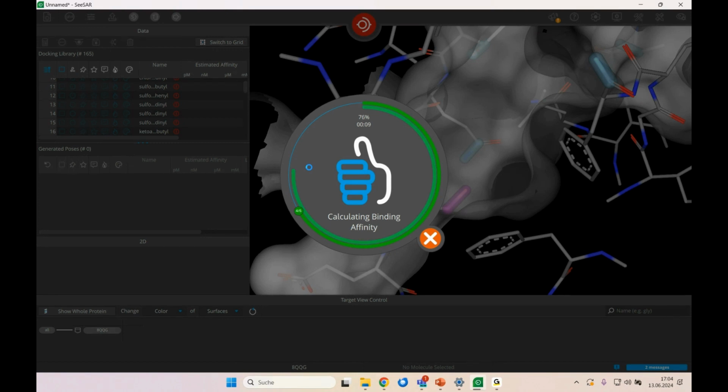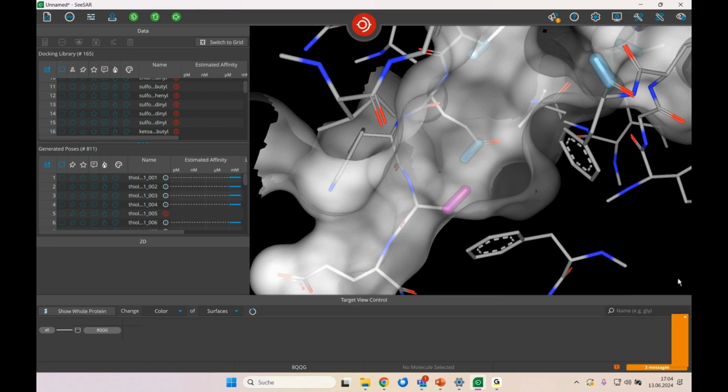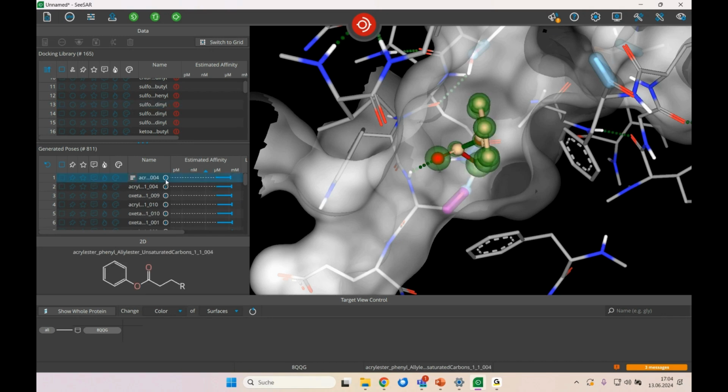So basically, this is also quite novel to the software. It was introduced in 13.1. The warheads that are now present in compounds are automatically detected and transformed into their bound form. So no workarounds required. And those are the results. Yeah, and the chemistry is also automatically performed. So the warhead is connected to the cysteine or the other selected amino acids. The respective chemistry is automatically performed.